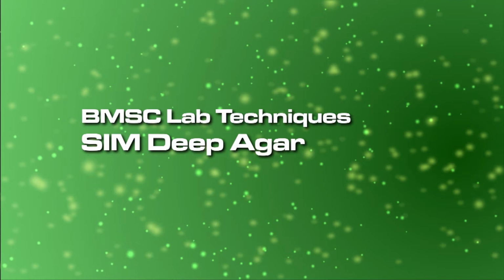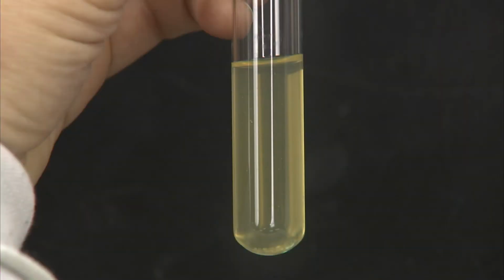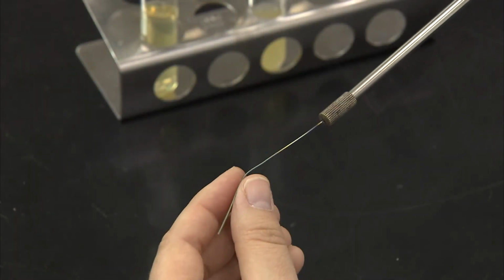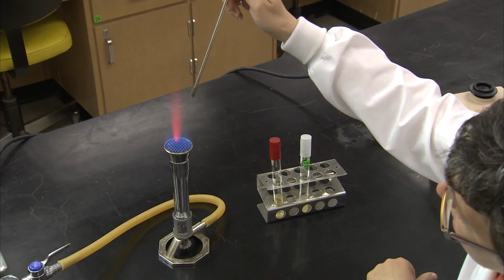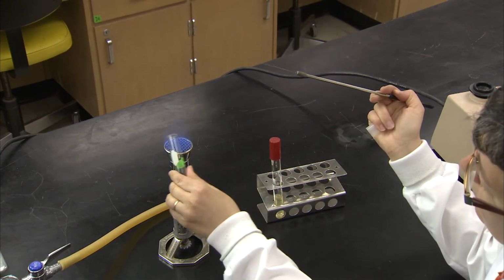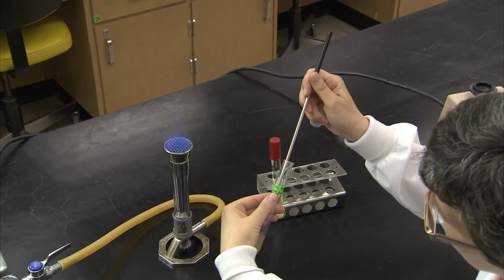SimDeep Agar is a multi-part testing system. The media takes the form of a semisolid deep, a tube of low-concentration agar that allows cells to migrate through it. To inoculate this deep, a wire needle is straightened out and then sterilized. The wire is placed into the inoculating culture and pulled out. It is now coated with cells.